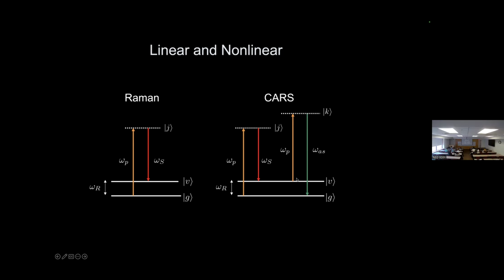And that means that with the last beam, this probe beam, omega P, I kind of scatter off of them in such a way that all photons that come out are in phase. So I have basically created a situation where I have coherent Raman. I have basically made sure that all molecules reinforce one another in terms of their emission, and therefore I get a much stronger signal.